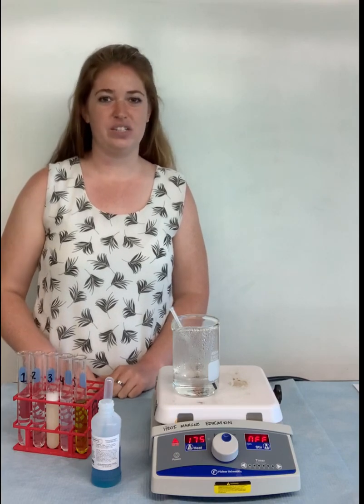So let's go ahead and do the first step of this test, which is adding the Benedict solution. And we're going to add about 20 drops of Benedict solution to each test tube. So let's go ahead and do that now.